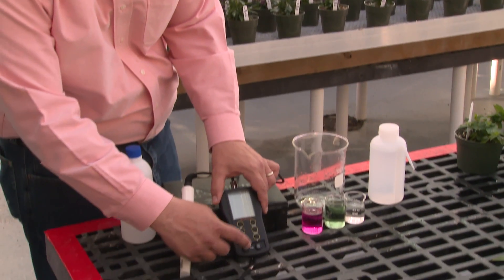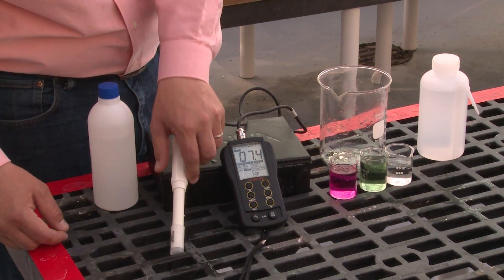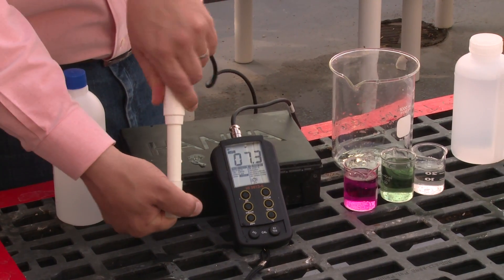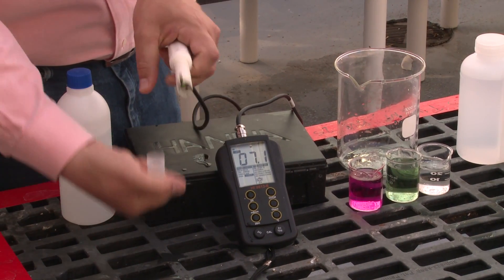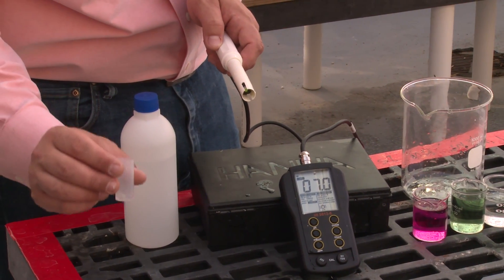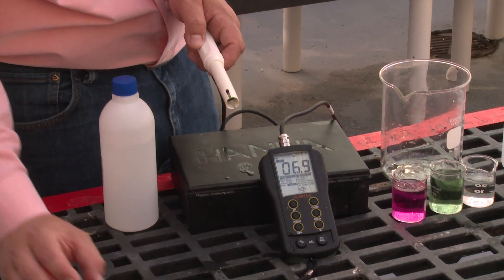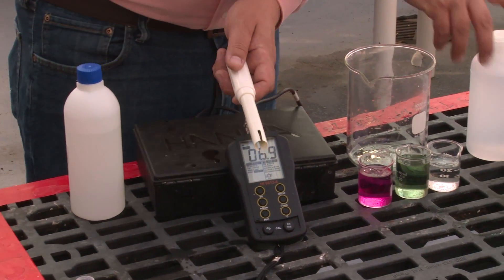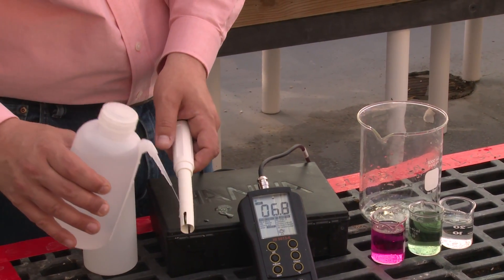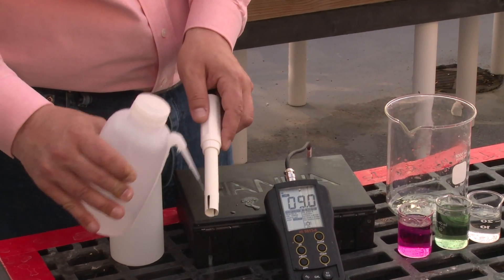First, we want to turn our pH and EC meter on. Next, we want to take our probe and remove the cap. Make sure that you set your cap upright because you should have some storage solution that helps maintain the life of the probe, which we don't want to spill out. Before starting our calibration, we want to take deionized or reverse osmosis water and rinse off that storage solution on the probe to make sure that we're getting accurate readings.